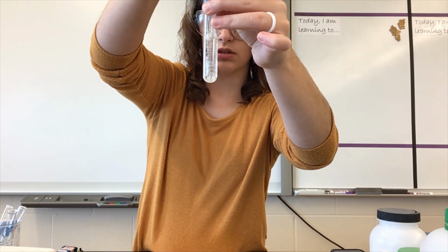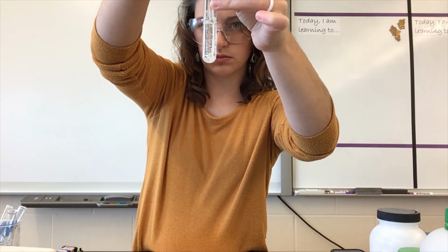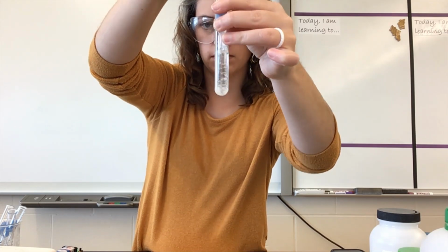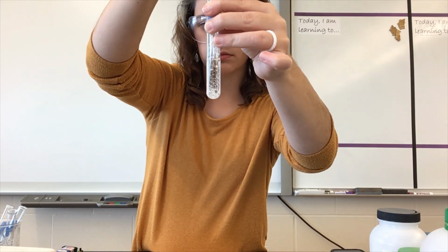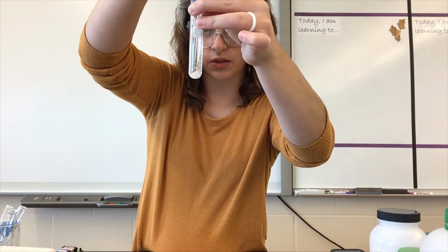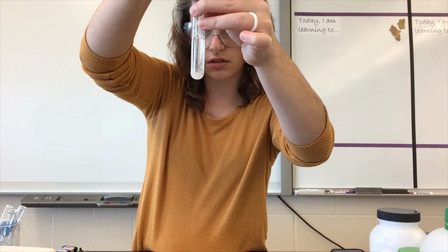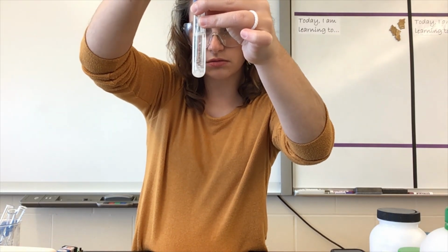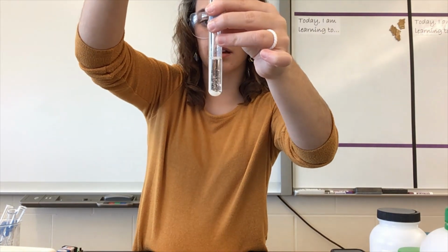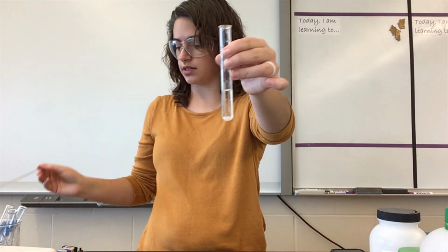Actually, it kind of looks like a snow globe. Nope. So it'll just sink to the bottom. I don't think any of it has dissolved. Okay, not soluble in water. Not soluble in water.